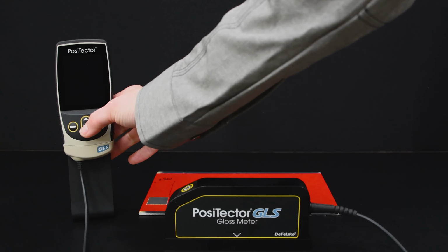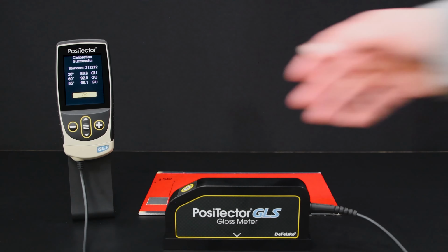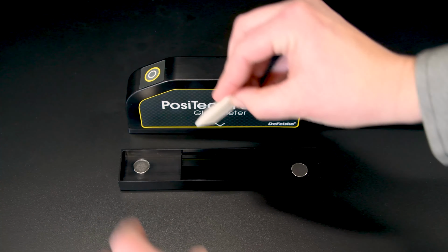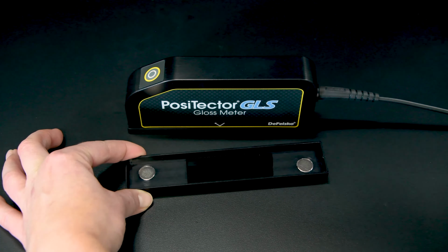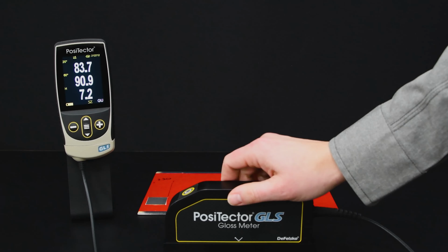Power the gauge on with the center navigation button. The PosiTector GLS will automatically perform a calibration every time the gauge is powered on. Be sure that the probe is fitted into the included protective baseplate with integrated calibration standard. Periodically, or when dust or debris is visible, the glass standard should be cleaned using the included cleaning wipes. Ensuring the standard tile stays clean is critical to ensuring the accuracy of the meter. The PosiTector GLS is now ready to measure.